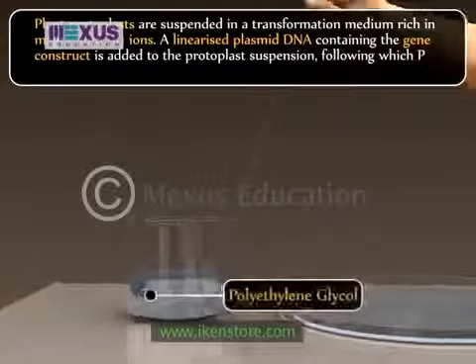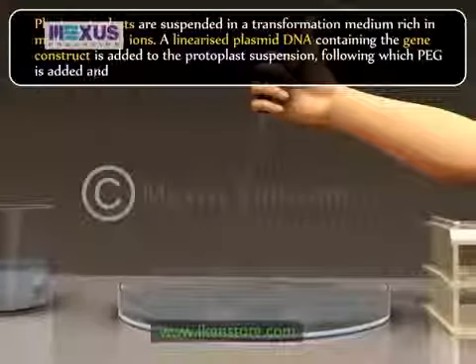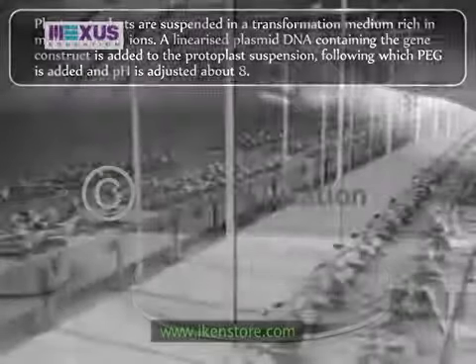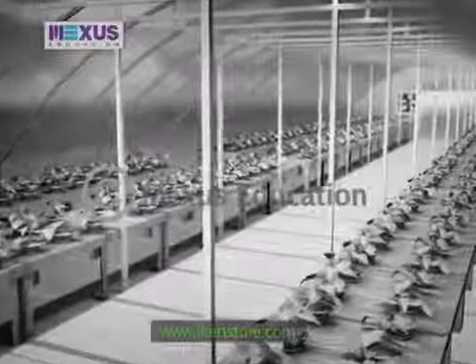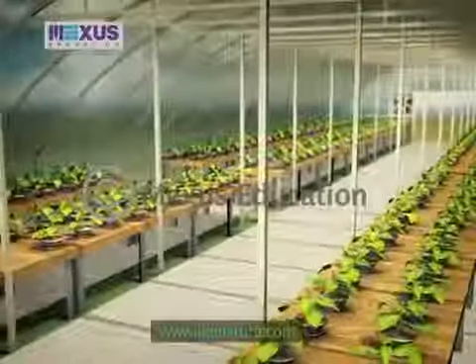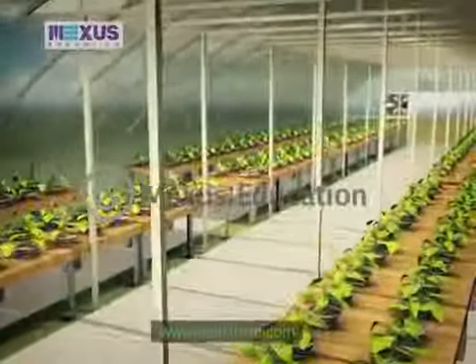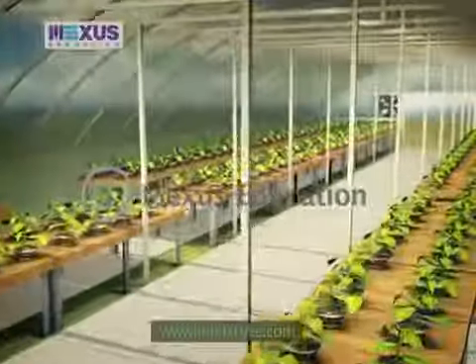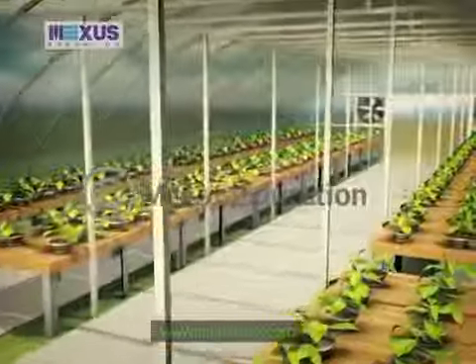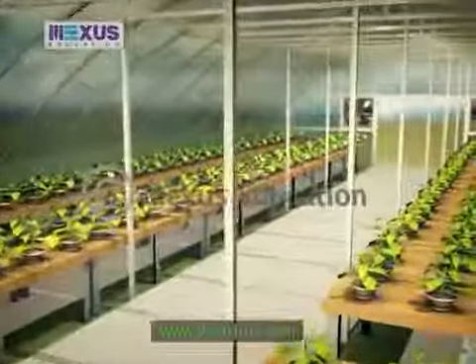Following which PEG is added and pH is adjusted to about 8. Treated protoplasts are then cultured where the regeneration takes place and the transformed cells are selected. The PEG method is used to produce transformed cells in tobacco plants.